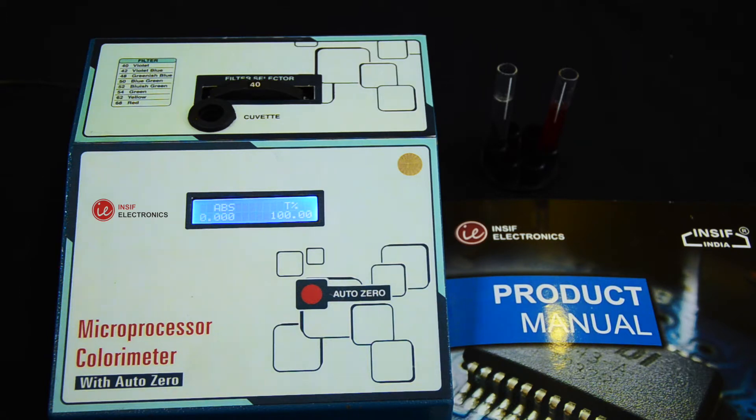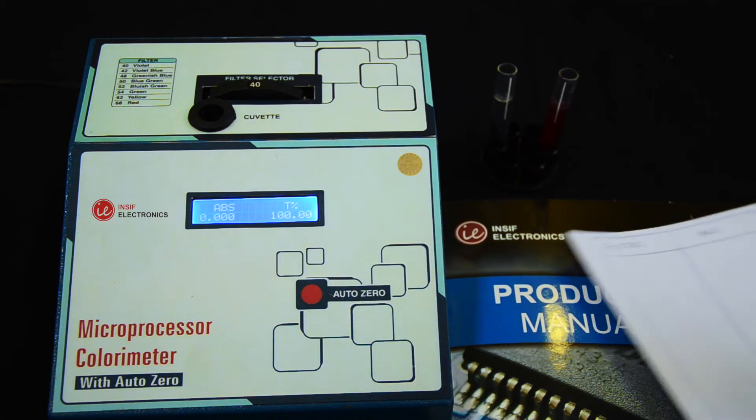The output is available on an LCD display in terms of absorbance and percentage transmission. The instrument comprises a wide range of filters from 400 nanometers to 700 nanometers.